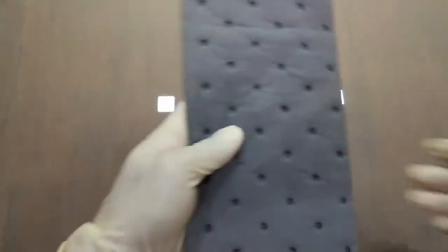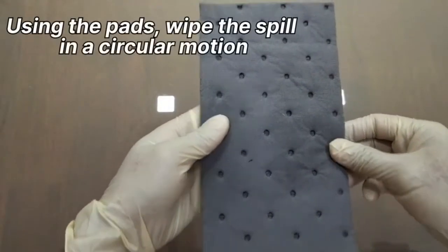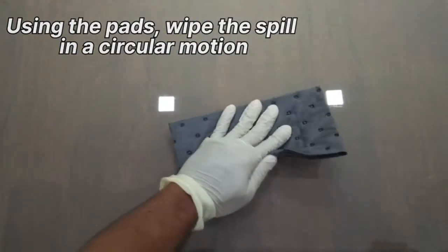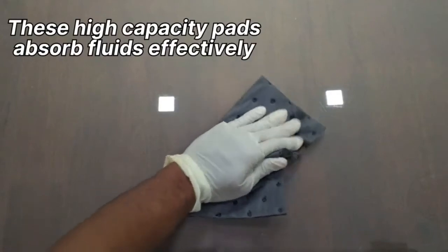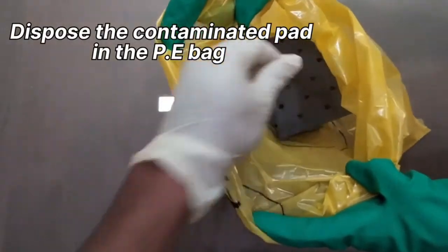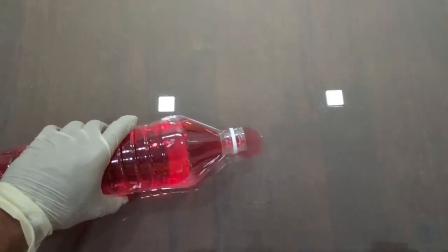Pads and Gelisorb can be used to contain and clean up body fluids and blood spills. The disinfectant in the Gelisorb ensures immediate decontamination of pathogens.